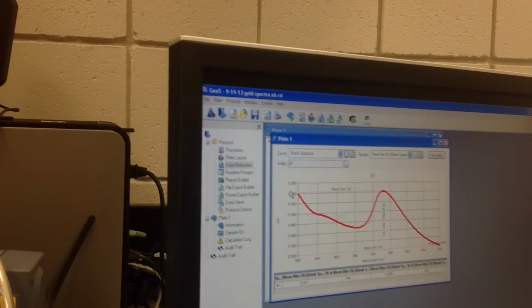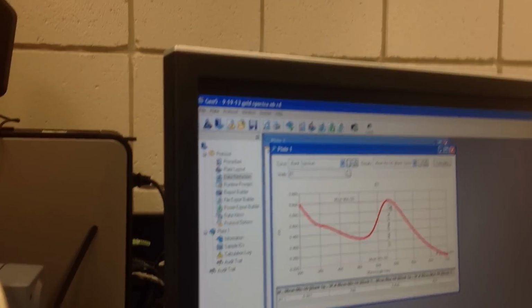We can do it. I'm just looking at them. I'm kind of curious to know what they look like. So I can turn this off.